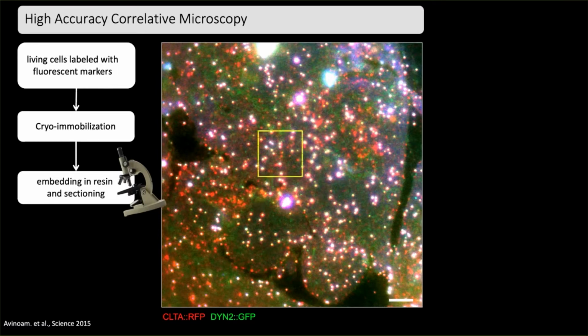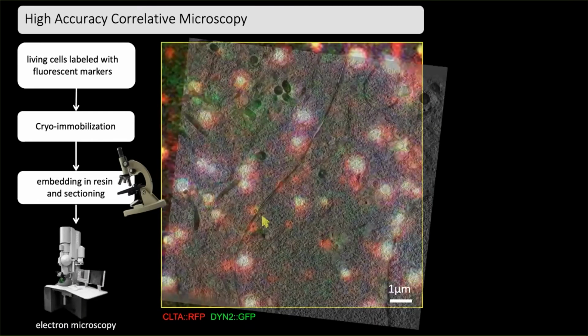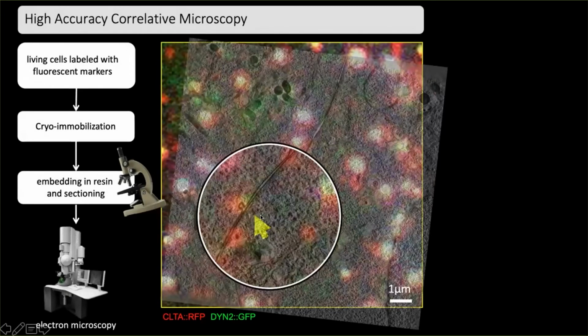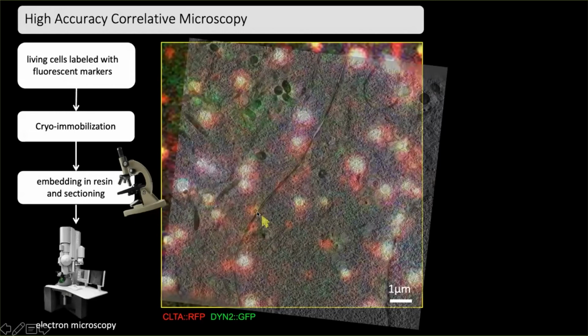And if I zoom in, you'll also see a spot here that also has the dynamin signal co-localized. Let me see if I can highlight it. I'm using a new famous sort of flashy pointer. So you see that there. So this allows me to take images at the very same spot, and I'd like to name some advantages.